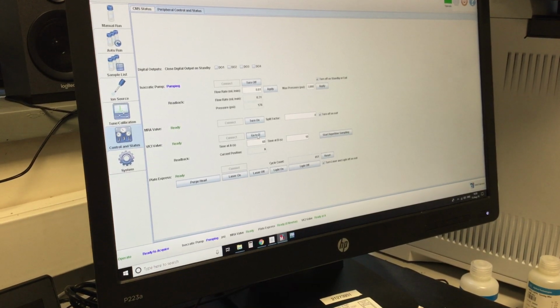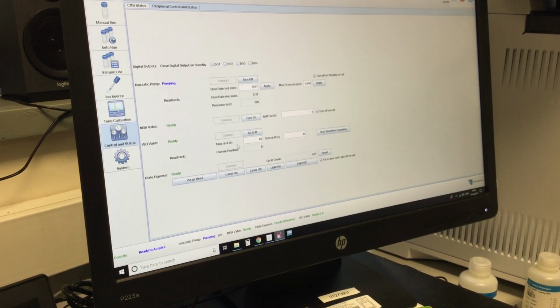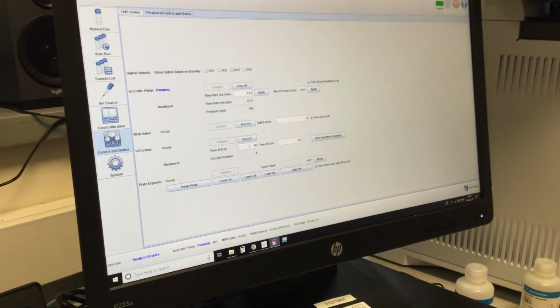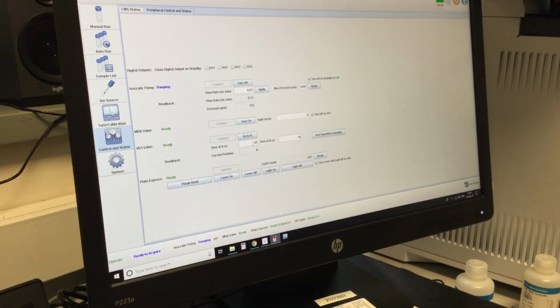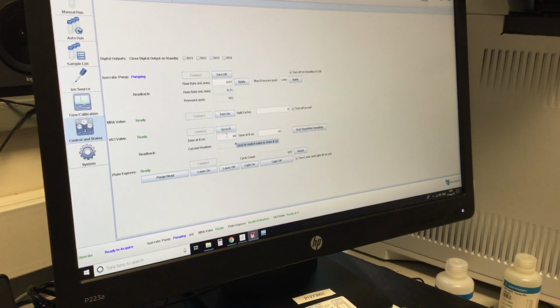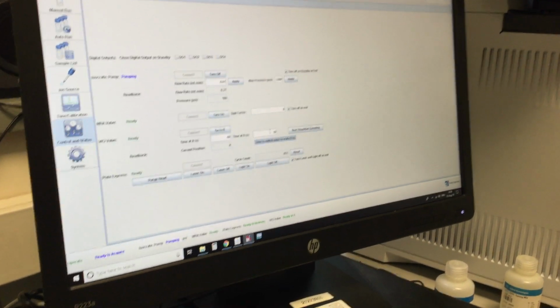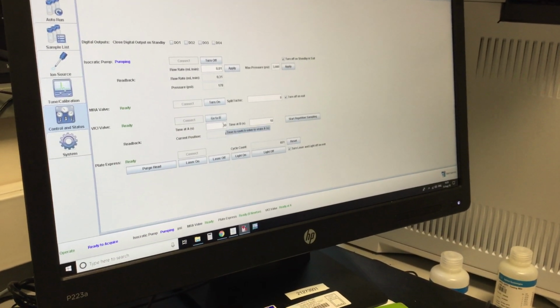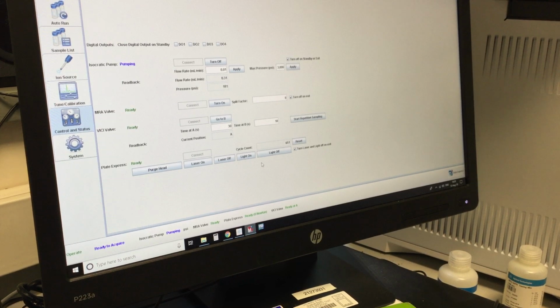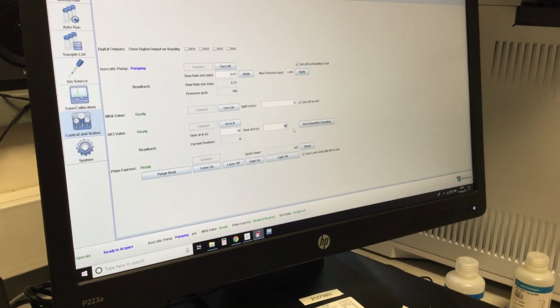Okay, going from position A to position B. So position A is the time that it's not sampling the loop, and position B is the time that it is sampling the loop. So A would normally be your sampling interval, and B would be your acquisition time for a sample. So let's say, for argument's sake, let's do 30 seconds there, and we'll do 15.